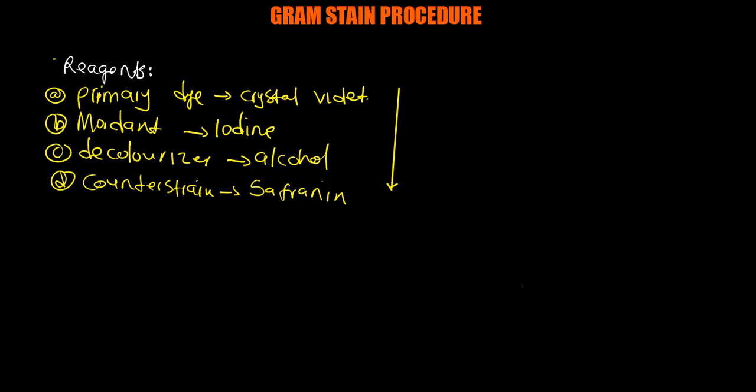Now these are the things needed. So how do we use them now? The first stage, so we'll say stages now. What you do is there will be a sample, not really a food sample, but a sample, because we are getting a sample from, let's say, a certain soil wound. We are going to flood that sample with the crystal violet. So we start with crystal violet.